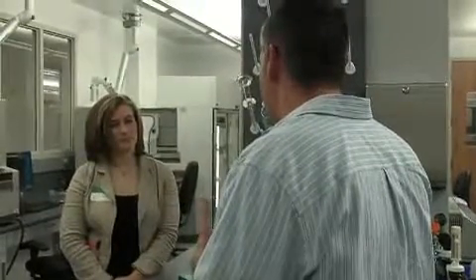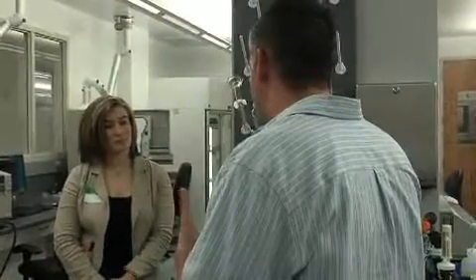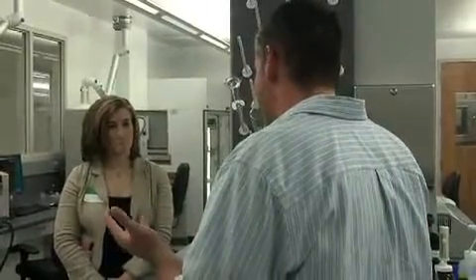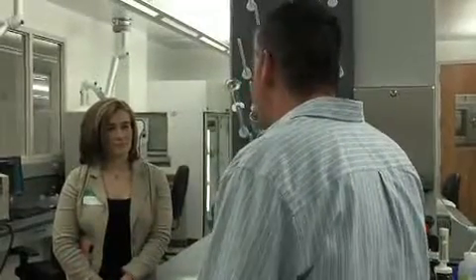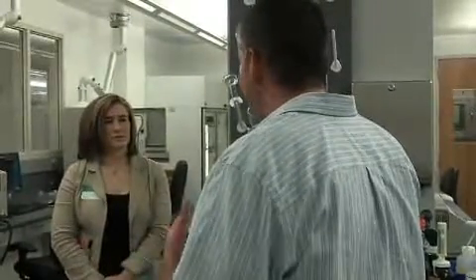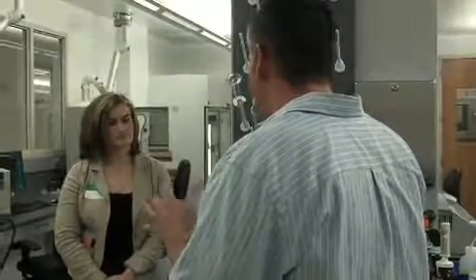What we've noticed in this room since we've been here, the 3130s actually keep track of the ambient temperature in the room. So you can actually pull up a screen and it'll show you what the temperature was in the room through the entire run. At the old lab, we were seeing a fluctuation of up to 7 degrees in 1 minute, which is a huge fluctuation for us. With these, since we've been in here, they fluctuated less than a half a degree over the entire 30-minute run. So, as you can see, the hoods along with the new heating and air system, everything has made this room a lot better for the analysis.